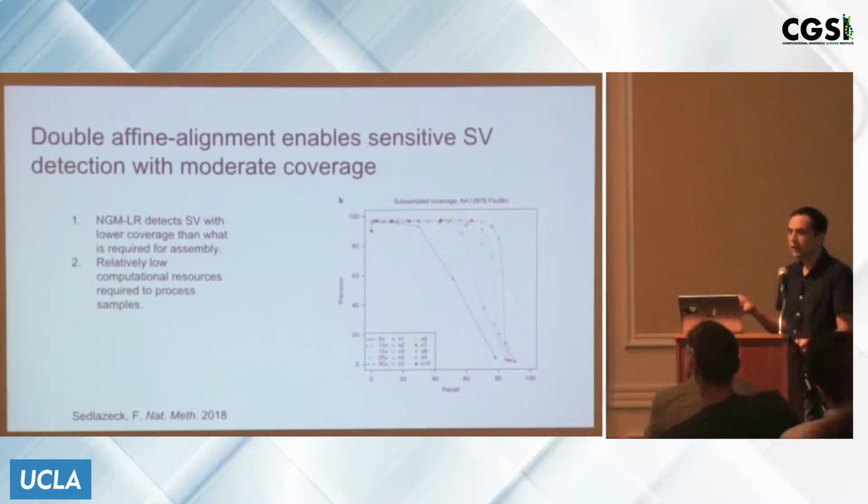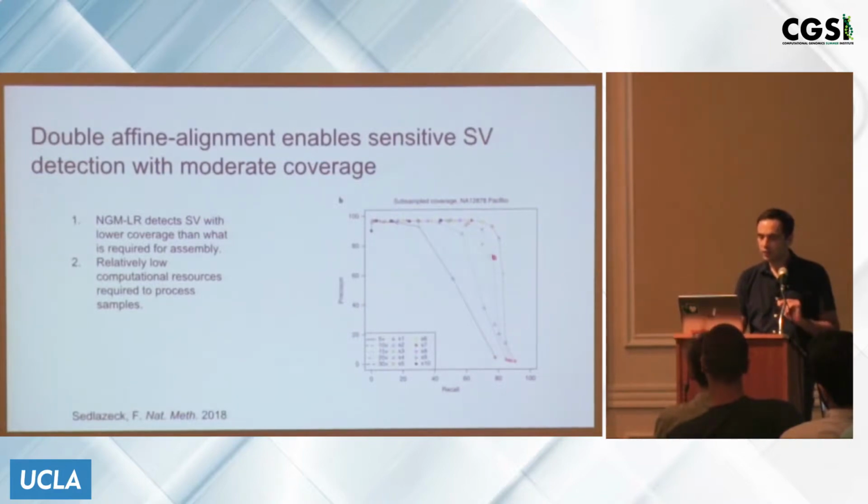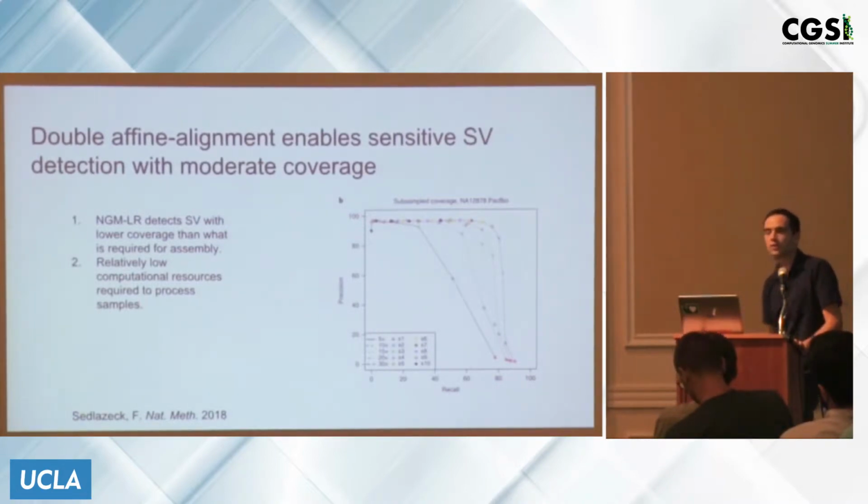And so since you're not having to assemble sequences, you can actually downsample and see what the ROC curve looks like with lower and lower coverage. And what you can get is, with what should be fairly easily achievable, say, an 80% recall. So this is actually somewhat out of date. They've been pushing these methods further since the paper was published. And so you get 80 to 90% recall at about 10x sequencing coverage. So it's a fairly sensitive method to detect variation.